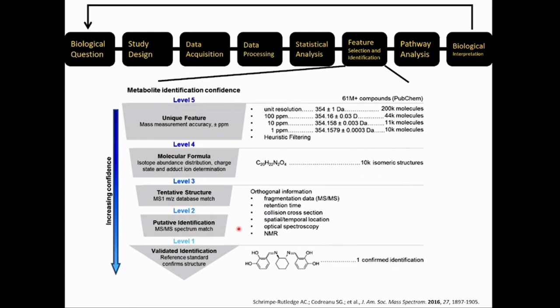Let's say Amy and I find a biomarker that we are fascinated by. Well, then we'll throw the kitchen sink at it, but only for a couple of interesting peaks. You've probably done work in this area because you're asking the right questions. Yeah, I work in a mass spec facility. Okay, so you know what I'm talking about.